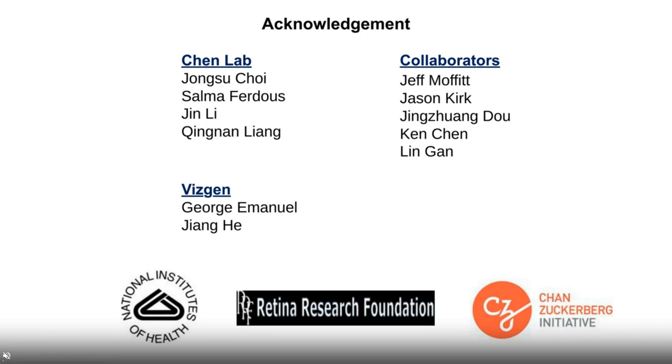Another thing that speaks for the sensitivity and the power of it is that this also makes it highly quantitative, so we are able to quantify gene expression even for very low expressed genes. And these two features don't compromise, as Dr. Chen was mentioning, the detection efficiency. We still preserve the very high detection efficiency of single molecule FISH because there are so many probes used for a single gene.